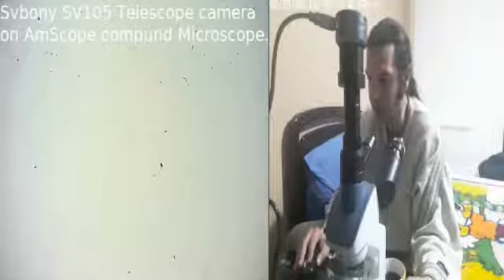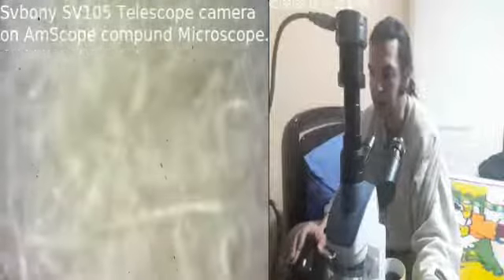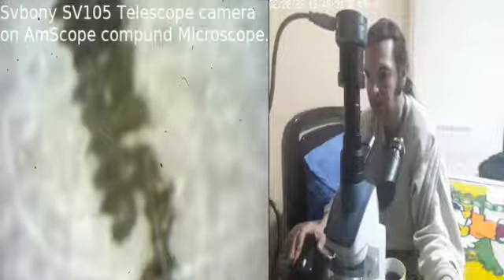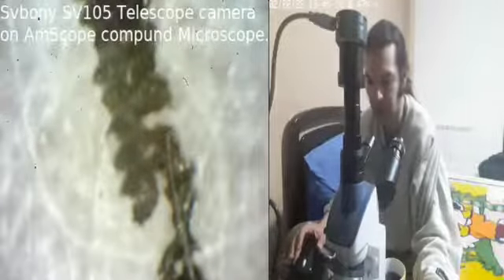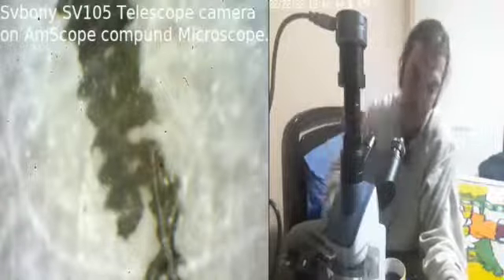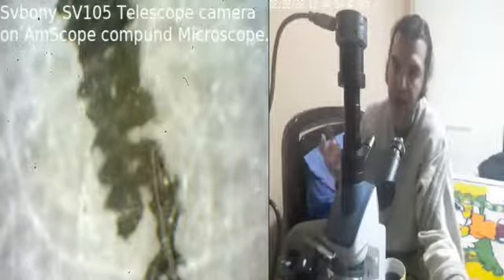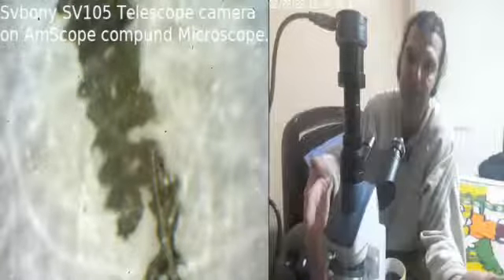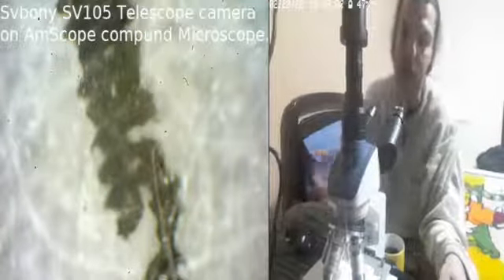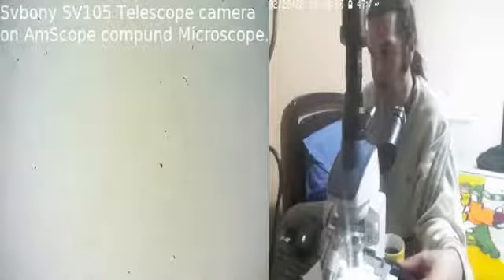I'm using a receipt because it's easier and cleaner. It's transparent so it can let light pass through for simple imaging. The camera stopped working again. Here I'll show you some text on the sample. I'm not sure if putting a focal reducer will help — without a focal reducer you use the full magnification power, and the microscope lenses act as the camera's lenses.